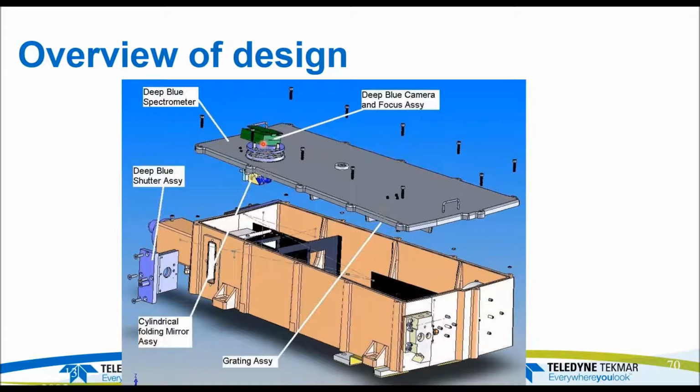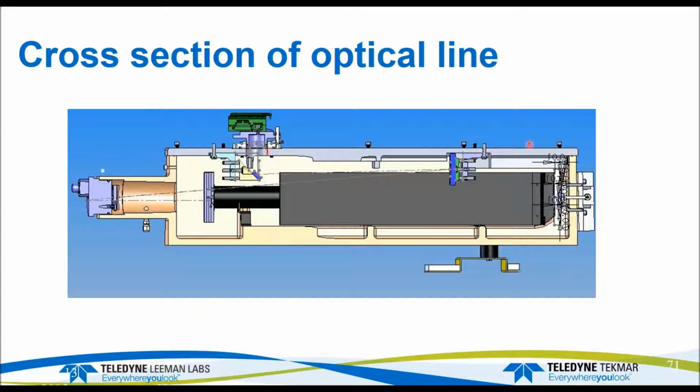another camera on the top of the optical system. And then basically there's another spectrometer, which is on the bottom. So over here, there's a grating, so the light hits a grating here, and then a mirror, and up into the camera, right? So sort of a side view. So the plasma is over here, over on the right-hand side.